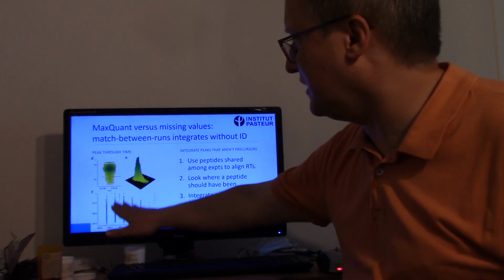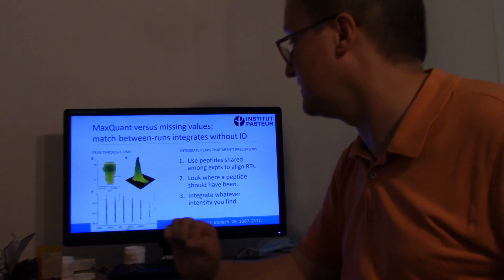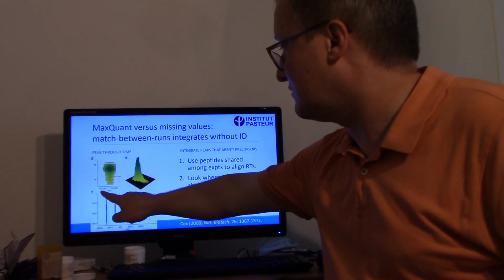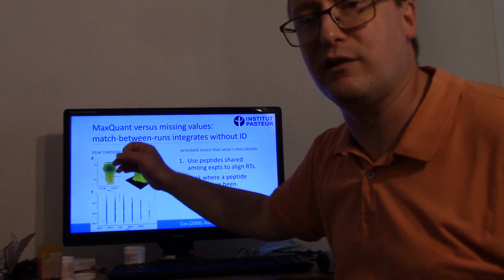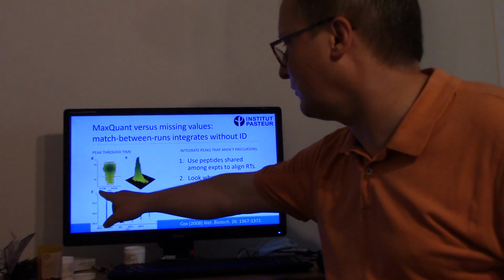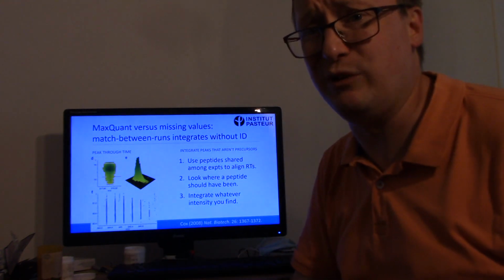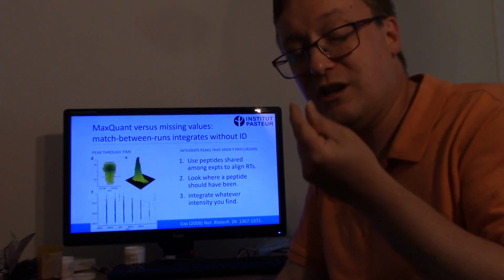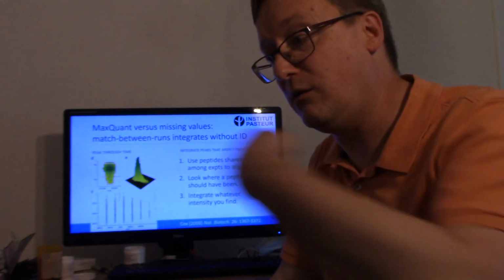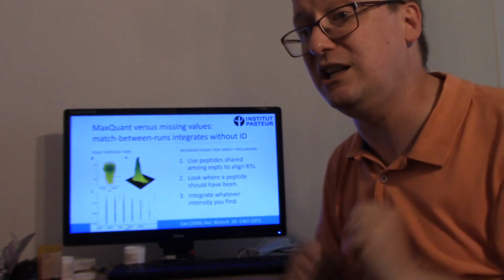But I'd like you to think about these peaks as they appear in mass spectra themselves. So in this case, we're doing an extreme zoom. You can see that the left edge of this part D of this figure ranges from only 917.98 up to 918.02. It's a tiny little minuscule part of the mass to charge range. So we're looking very closely zoomed into one tiny little peak.